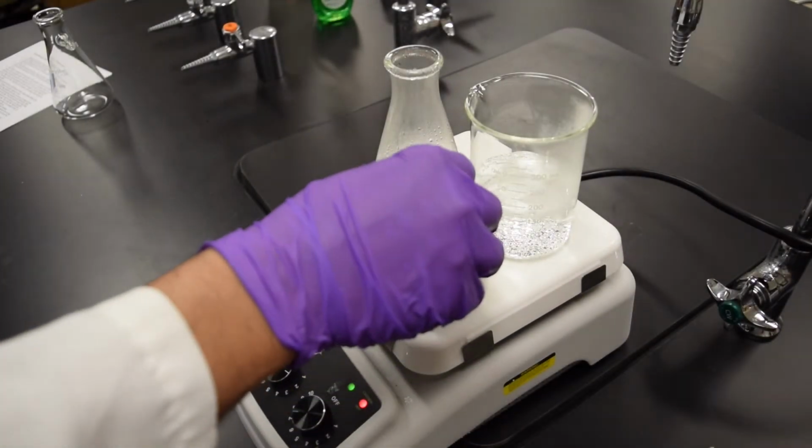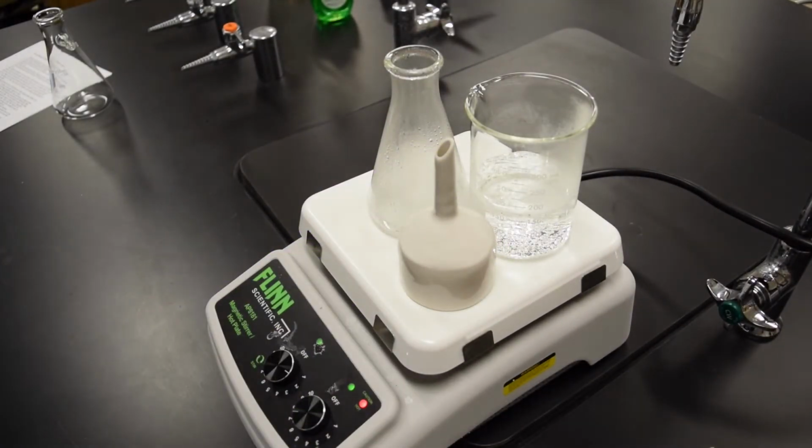The idea here is to heat the Buchner funnel in preparation for the hot filtration.